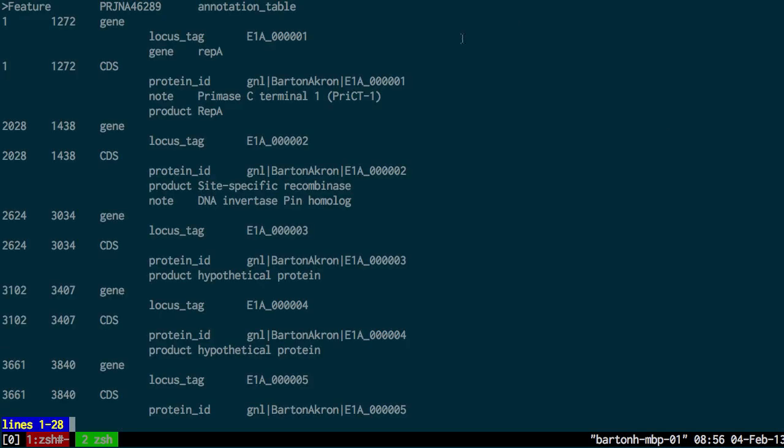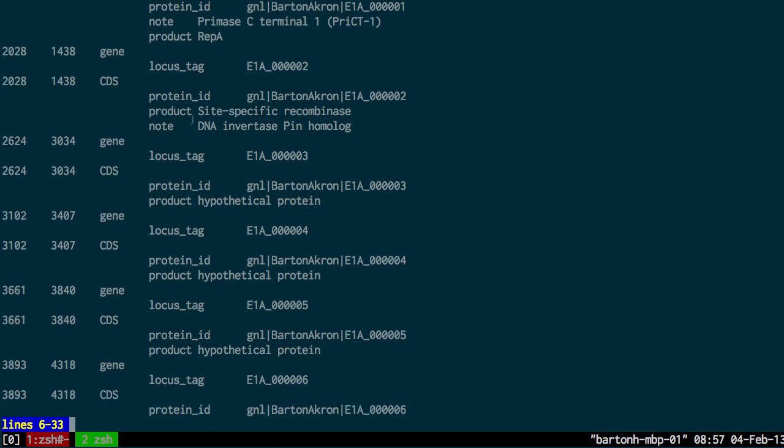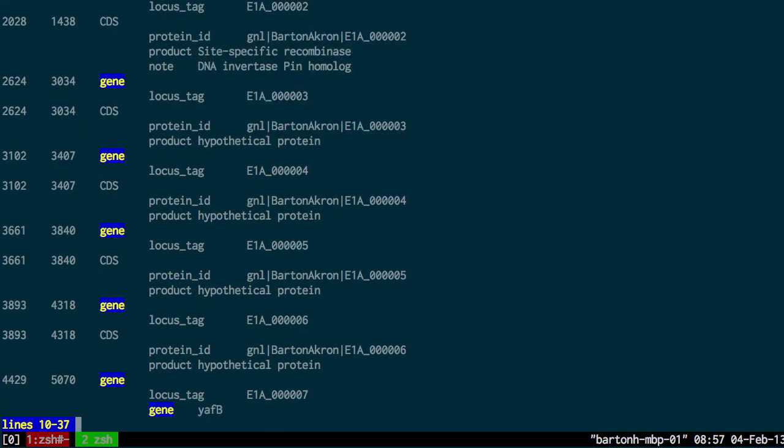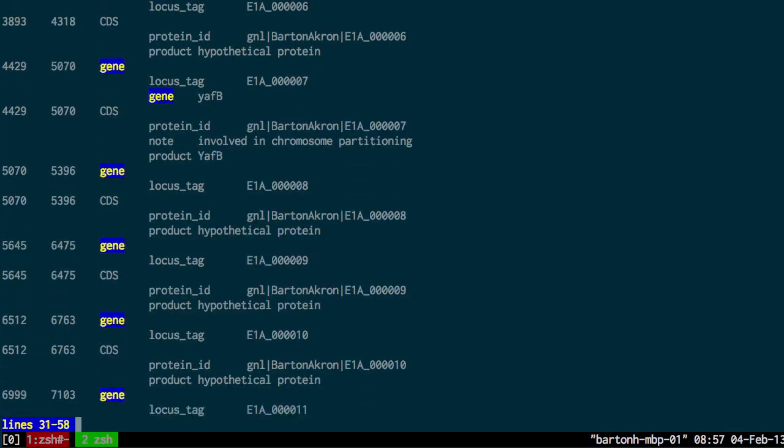So here you can see now I have the gene and the locus tag. But also I have this encoded CDS. So I have the protein ID, the note where applicable, the product. If you keep going down you have product, note. These are all the encoded features as well.